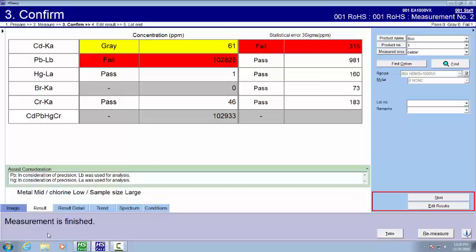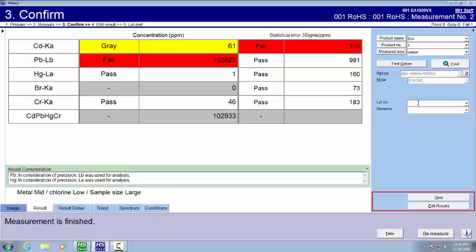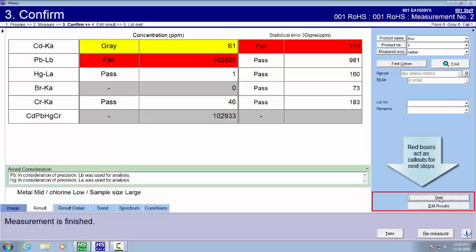The measurement is now finished. It says so in the bottom left. We can hit re-measure. If we didn't like the fact that cadmium was gray and we wanted to try it, we could do re-measure right now. We can go up here and type in lot number. We can hit remarks. It also saves different ones that have been in here. You can edit that. Let's go to next.